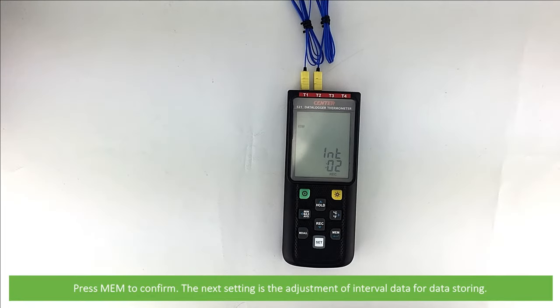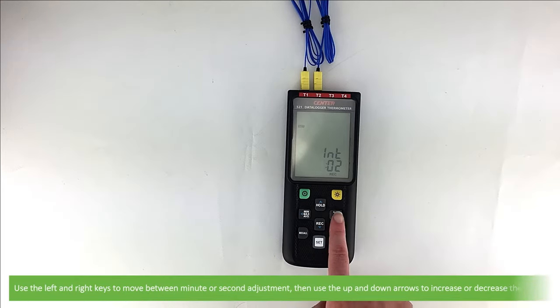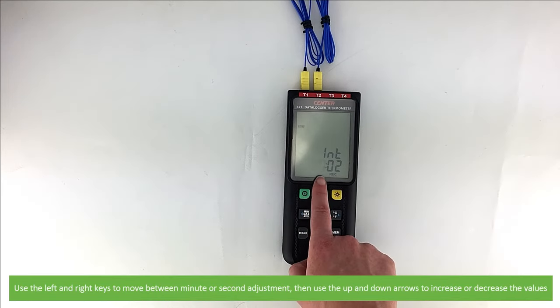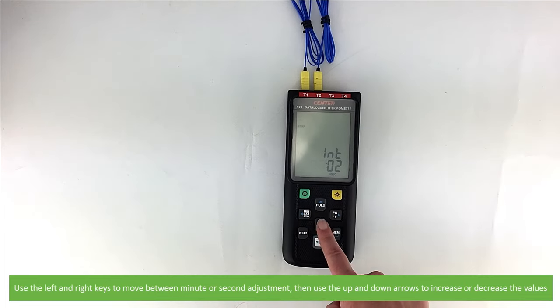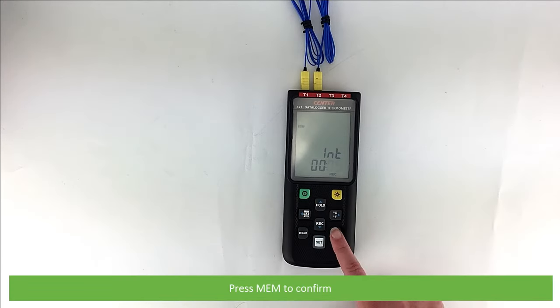The next setting is the adjustment of interval data for data storing. Use the left and right keys to move between the minute or second adjustment, then press up or down to increase and decrease the values. Press the memory key again to confirm.